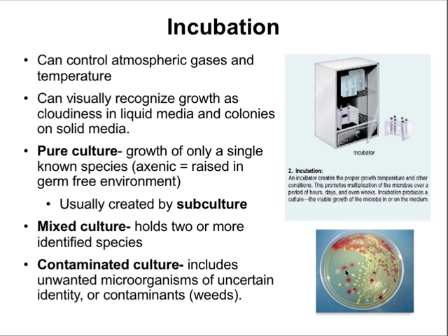Now, on occasion, a culture can become contaminated. That is, it'll include unwanted microorganisms or organisms of uncertain identity. These contaminants are like the weeds in our theoretical garden. In this case, we might take a subculture again, removing one of the samples and replating it. A whole new meaning for subculture. It's not just the underground.